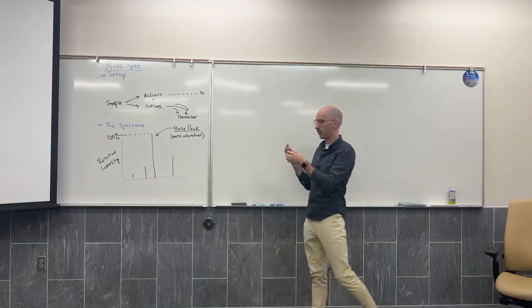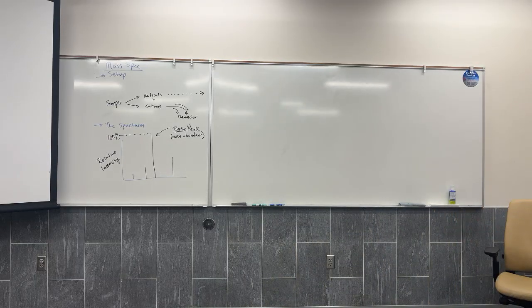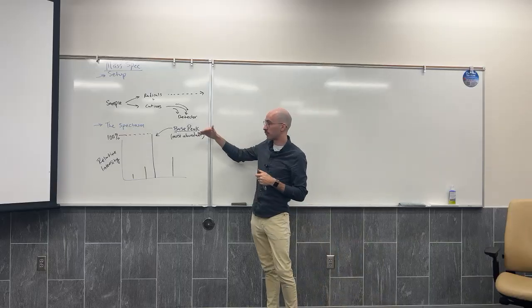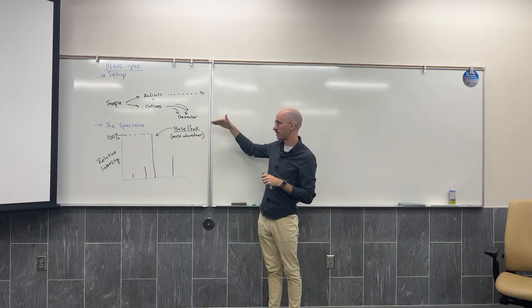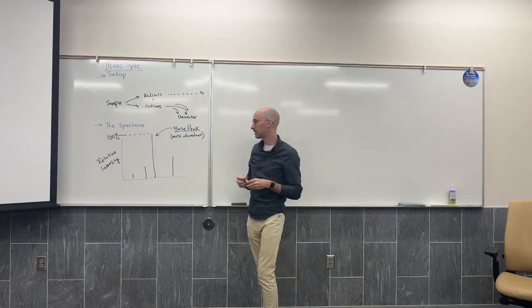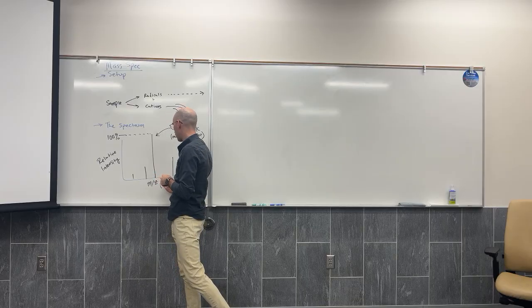It has 100% relative intensity. Relative to that peak, it is the most abundant. The base peak is always at 100%. Yeah, always. Because it's relative, it's always normalized to the height of the base peak. The x-axis is m per z, which stands for mass per charge.